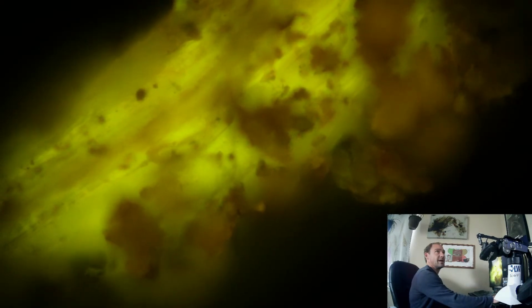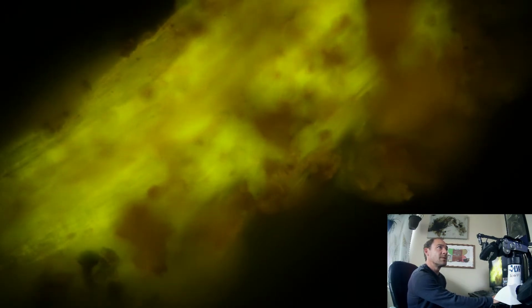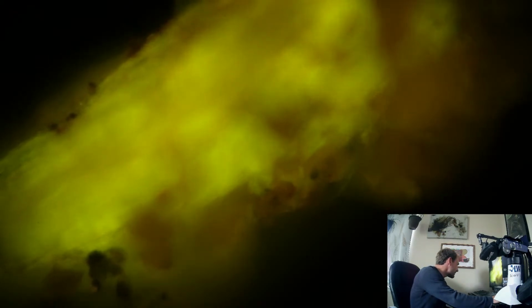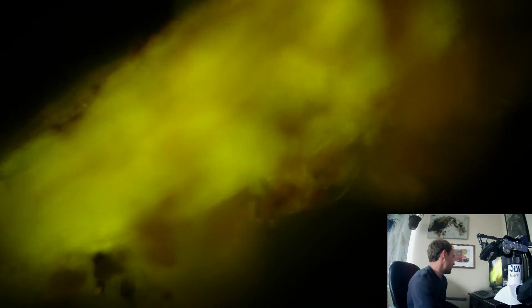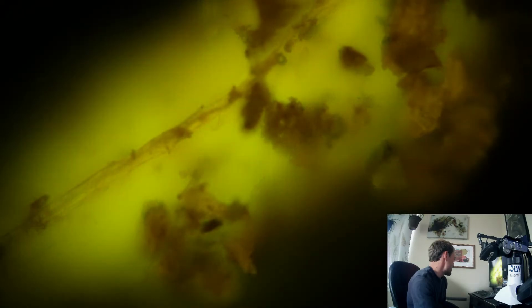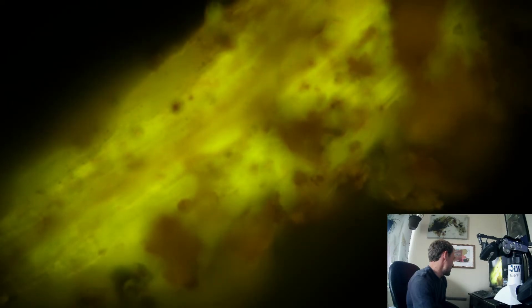But you can definitely see where'd my pointer go? There it is. Oh, I lost focus a little bit. Where'd it go? Going very bright green in the middle.